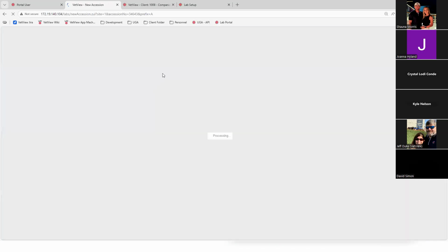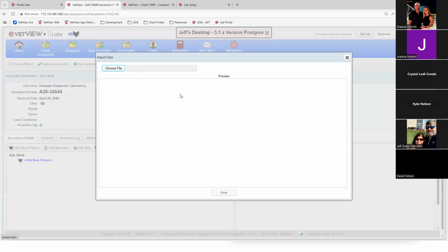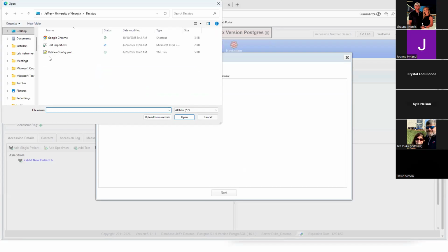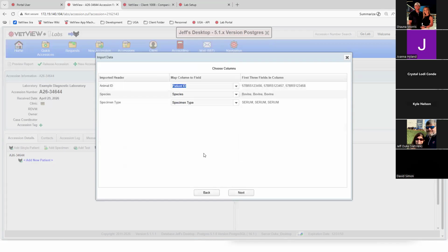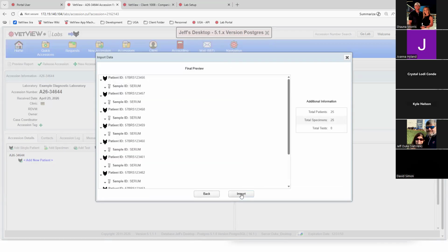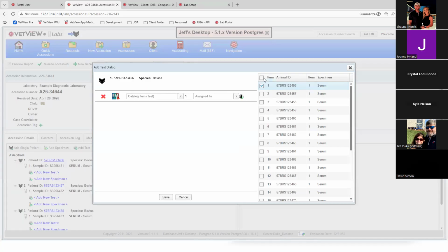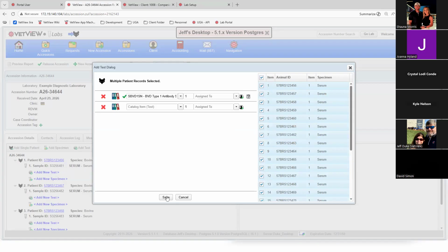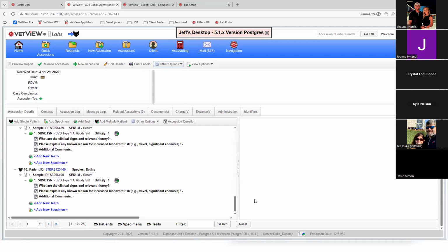So again, session, import. Templates sees the 3 columns, match those up. Next, next, import. Yes. And so again, you don't have to have even the test here in this case. Now at this point, you could come in, say add test, select them all, add my BVD this way, right? So if maybe they just give you a spreadsheet of all the names, you can then come in, add the test in to the list as well. So there's a lot of different ways to approach this.